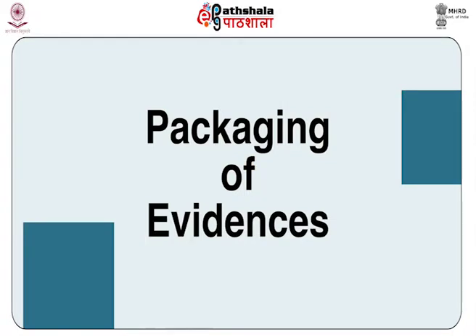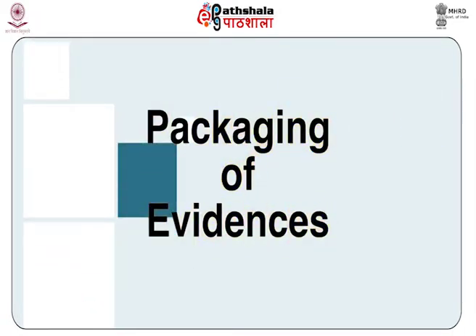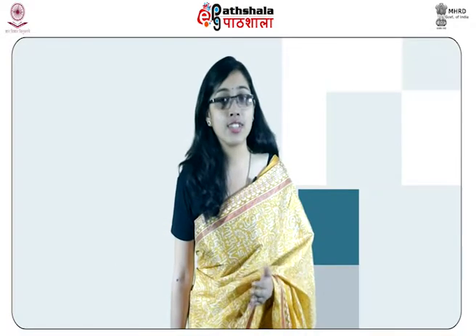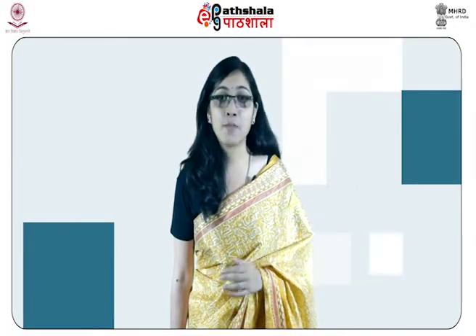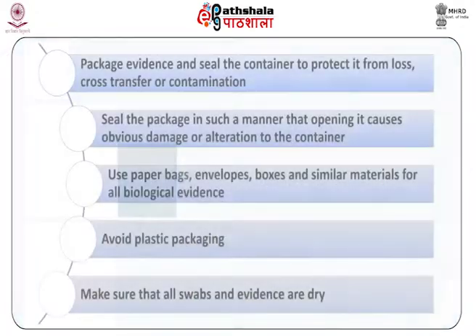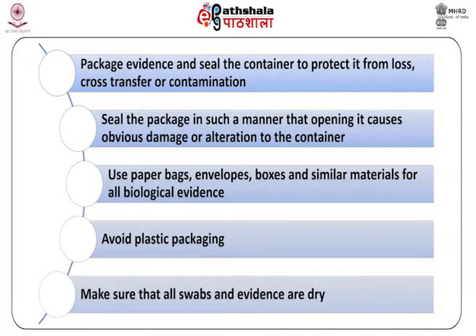Next, we will study the packaging of evidences. Various points should be considered while packaging the biological evidences at the crime scene. Package evidence and seal the container to protect it from loss, cross-transfer and contamination.